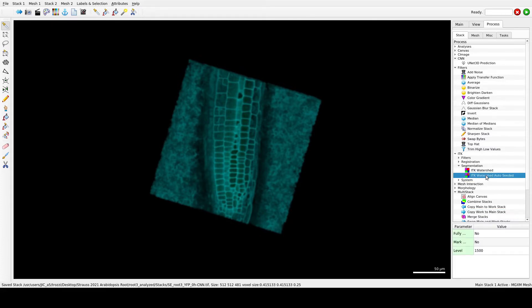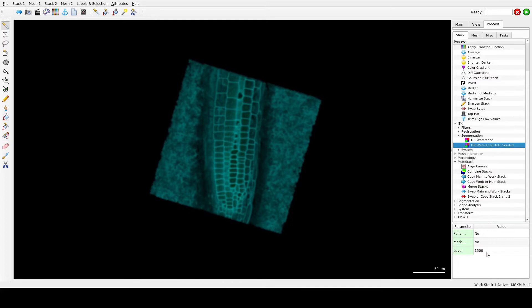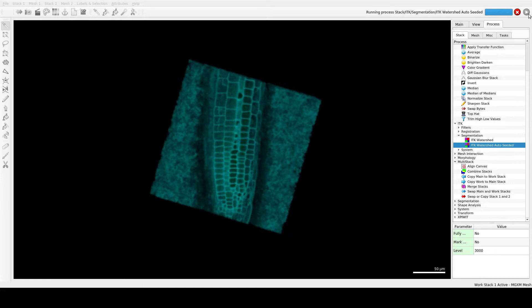This process can take quite some time, but you do not have to do any seeding. You can adjust the threshold — try something like 3000. If the sample is highly under-segmented with cells fused together, decrease the threshold. If the sample is over-segmented so that single cells are split into multiple pieces, the threshold needs to be increased.